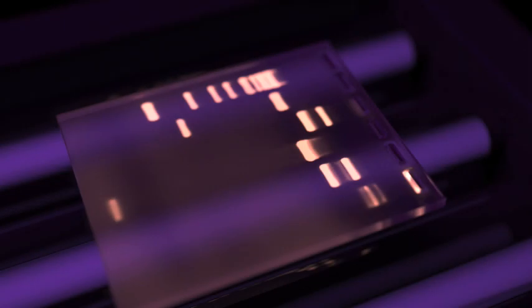the gel is placed over an ultraviolet light source to reveal the position of the DNA samples. The samples appear as glowing bands throughout the gel because the DNA has been stained with ethidium bromide, a small molecule that inserts within the DNA double helix and can be visualized under UV light.